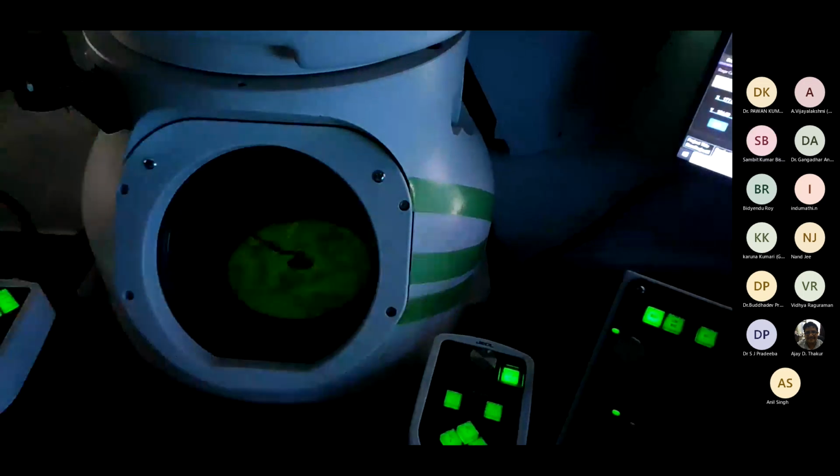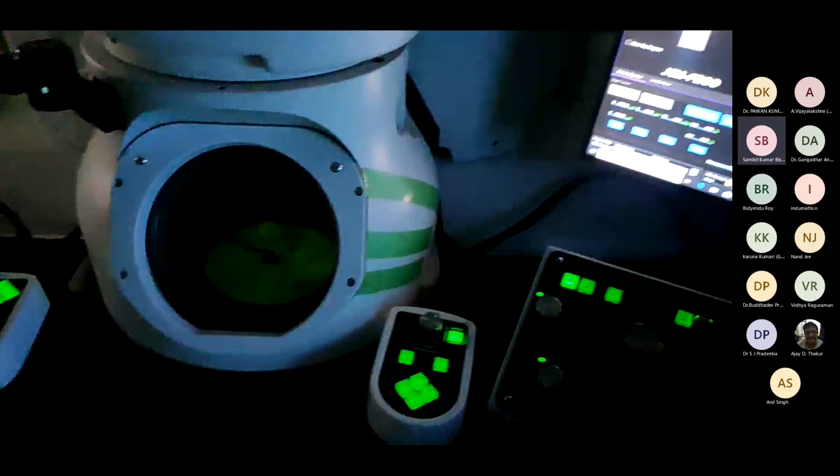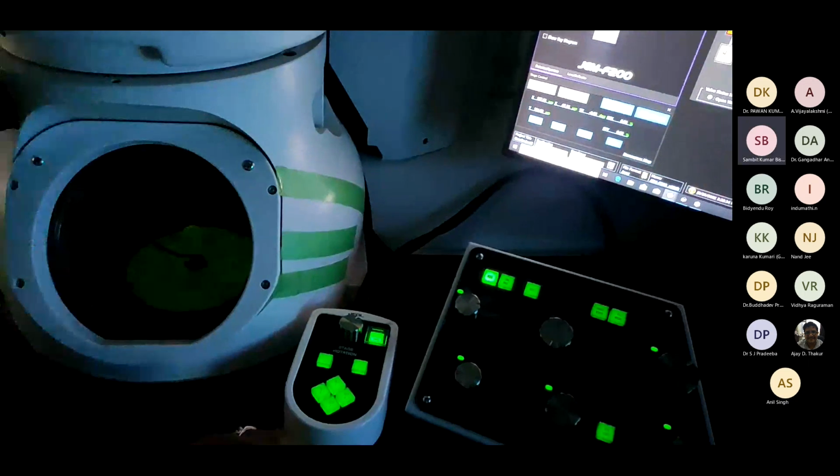Yes, it is contracting at the center. Okay, and expanding from the center. Okay, so this one is also done.